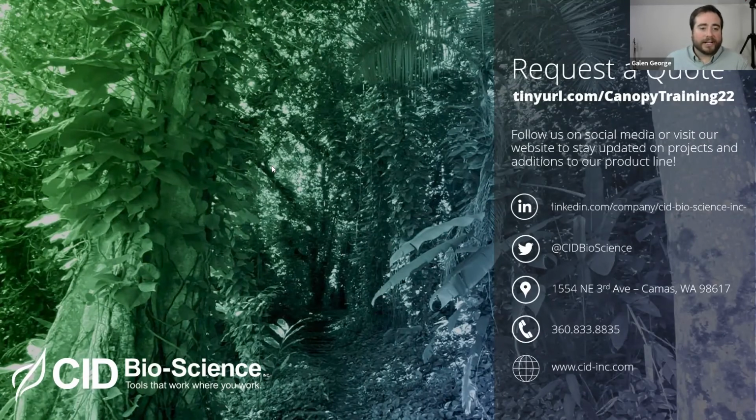Next question from Derek. Derek actually was one of the presenters on the webinar that I mentioned earlier. So good to see you, Derek. He's asking, is there a way to update the light above canopy for all images after they have been taken at one time, rather than updating each image individually? For example, I take 50 images and realize the light above canopy was not saved properly at the beginning. Can I update all these at one time?